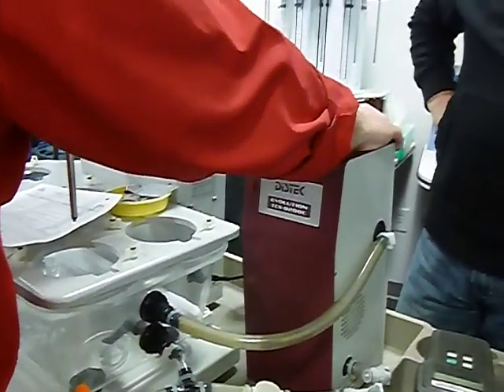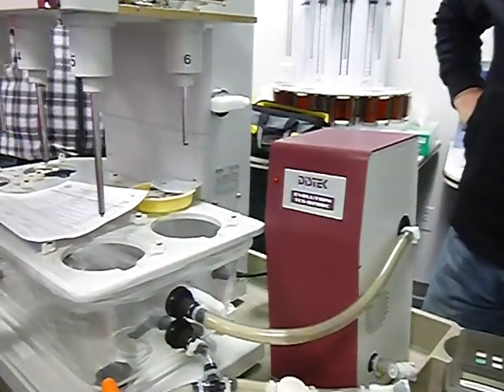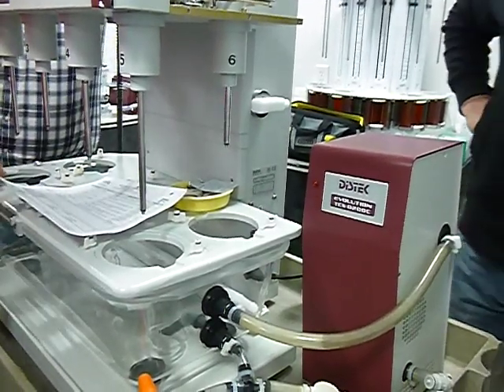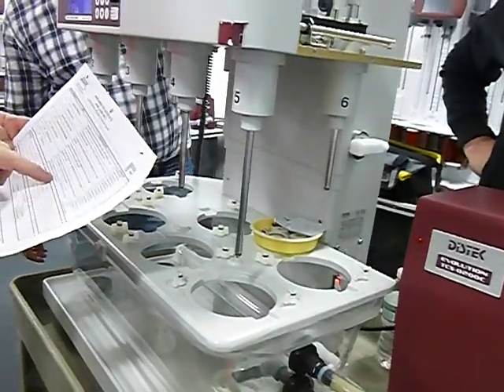so you want to make sure that it is actually turned on and activated. I don't have any water in here, so I'm not going to let it run right now. Make sure that it turns off. You want to make sure that it turns off and it turns back on again. So that's why they specifically ask you to turn it off. It says TCS shut off. The TCS pump should cease to pump.